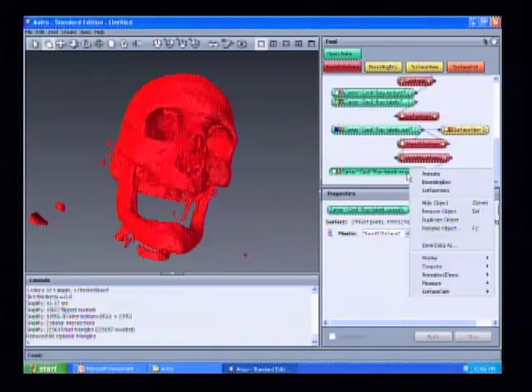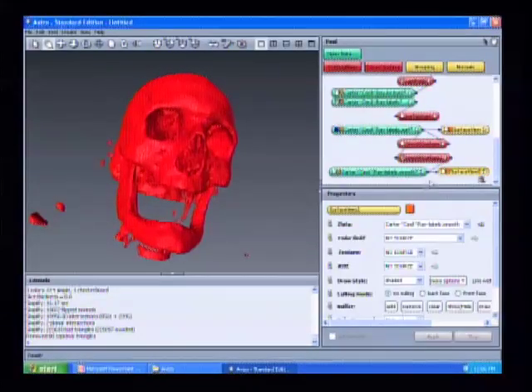If you want to, you can right-click and select Surface View again, and then you can come up to the original surface view that you had from the over 1 million faces, and click on this little orange box. What this is going to do is hide the original one. And you can see how smooth it went.